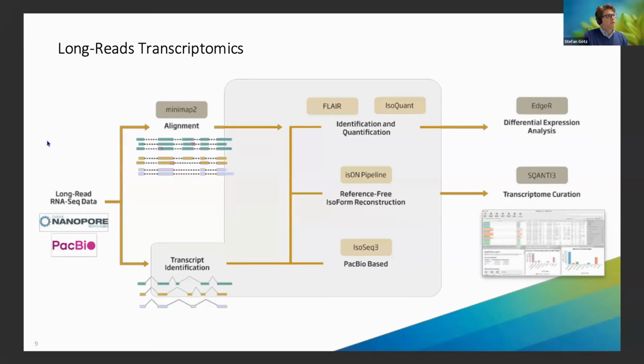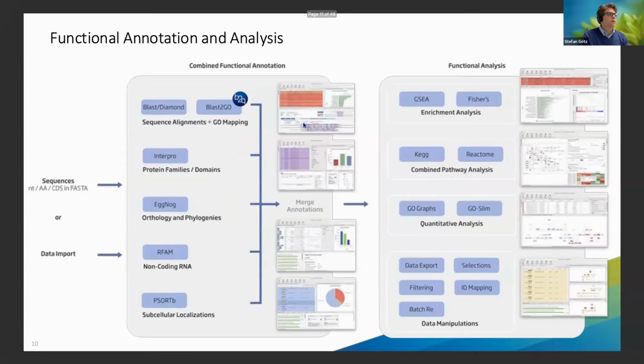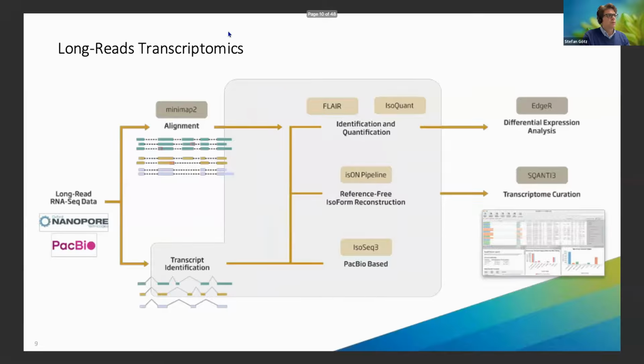So again, end to end for long reads in OmicsBox. I think we are one of those few platforms who support those kinds of pipelines already for long reads. Commercially well established. So if that's something you're looking into in the future, this might be worthwhile exploring as well.